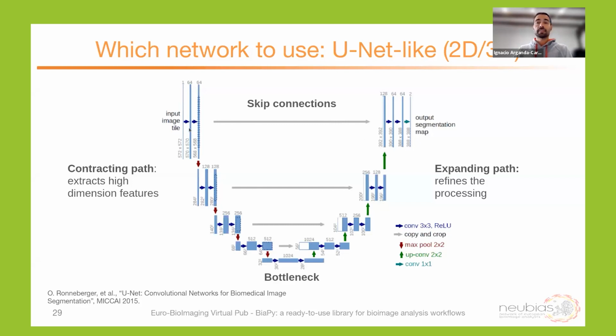And this type of network is used a lot, not only for segmentation, because imagine, the input is an image and the output is another image, so you can have the input image and labels, the input image and the noisy version of that image, or the super-resolved version of it, different channels, you can do pix2pix. There are a lot of possibilities for these networks. Even nowadays, in image generation from text, at some point they have something like this to produce the final images. And this is something that we can use for semantic segmentation to get the object probabilities of our object of interest, in this case mitochondria, could be anything else, at a pixel level, both in 2D and 3D.